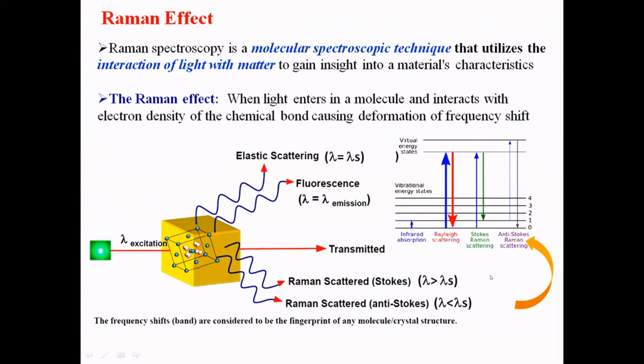You can understand it like this: you are listening to this talk, and at the end of the 1 hour, I hope a few will understand a little bit about Raman spectroscopy. You are all Stokes lines, so you get something after this session. In the same way, light comes and interacts with the material and comes out through an inelastic process, so the scattered light has some change in wavelength compared to the incident light. So that is helpful.